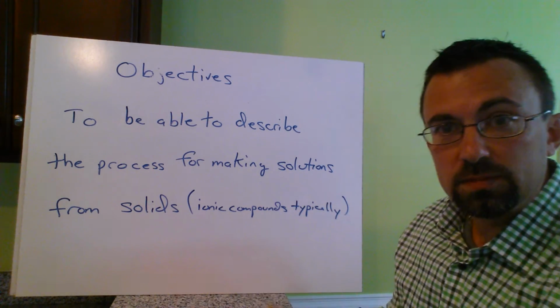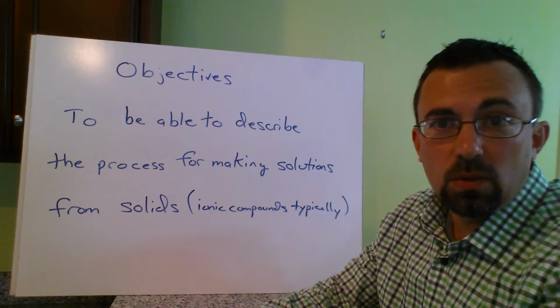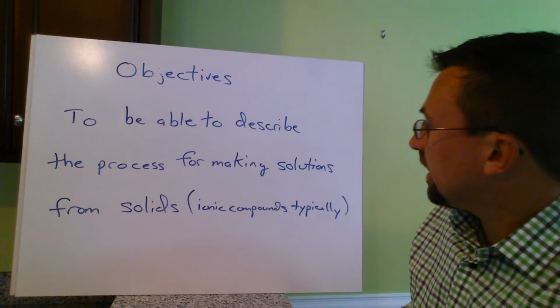Using molarity, let's make a solution. We're going to do two of these, one from a solid, one from a liquid. Let's start with the solids. Why? That's what we do more of.